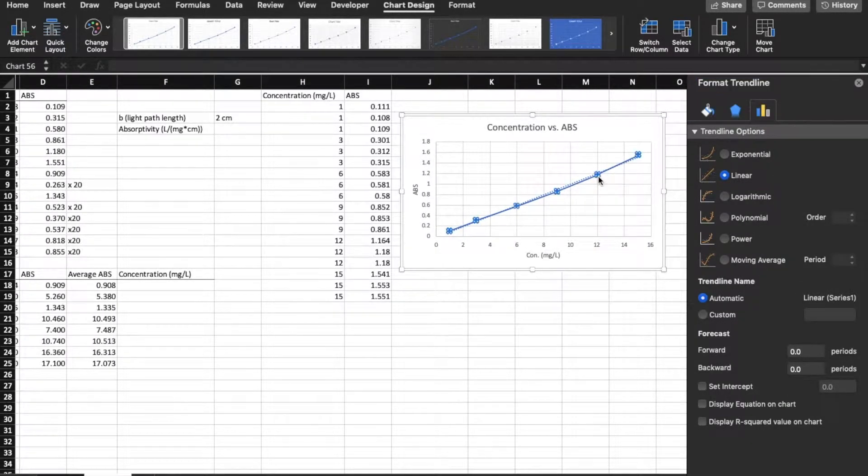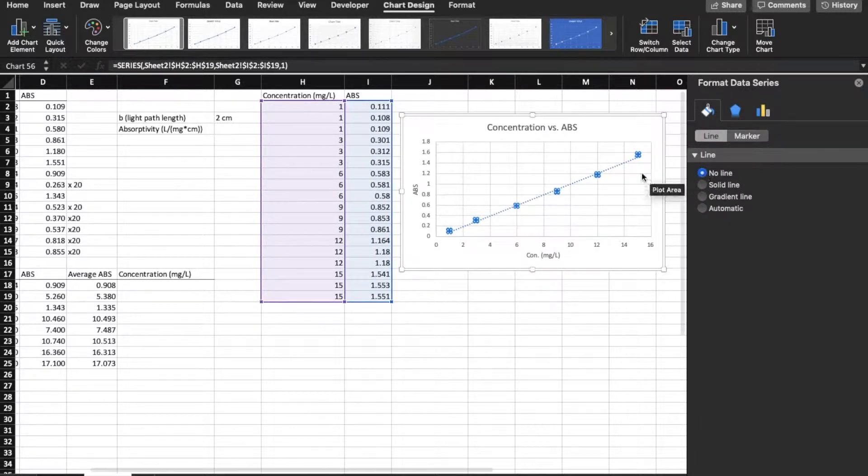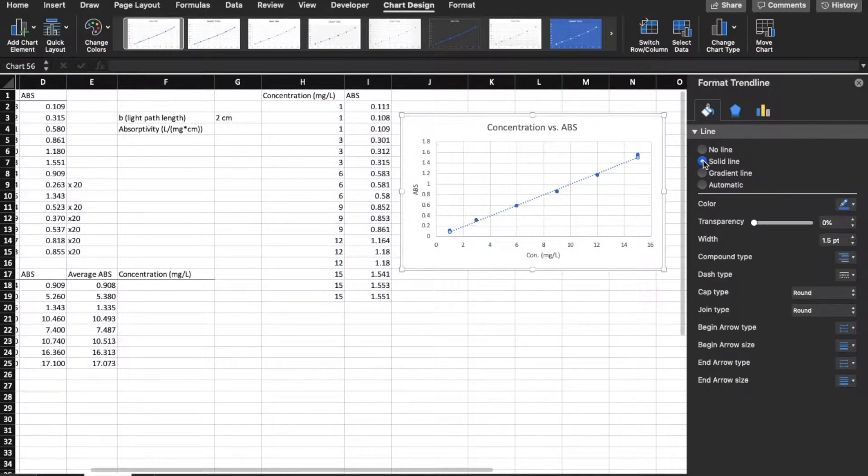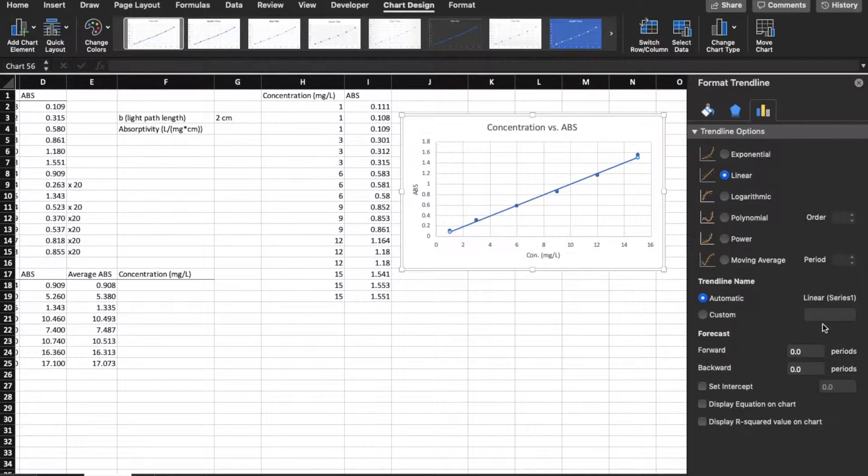First, I'm going to take the other line out that was there originally, so click on no line. The trend line, I'm going to make a solid line because I want it to stick out a little bit. And then at the bottom, or all the way on the right, I'm going to click on display equation and R squared value.